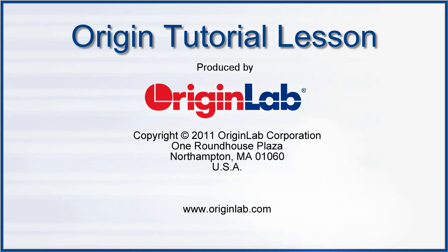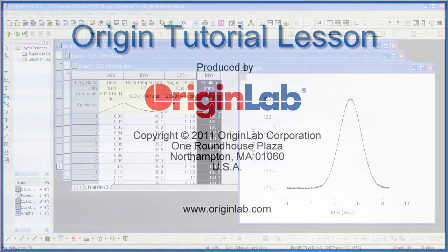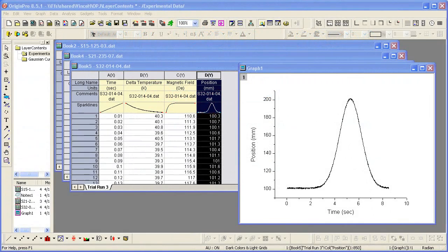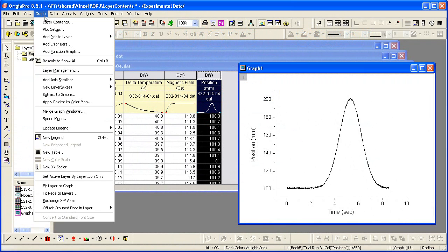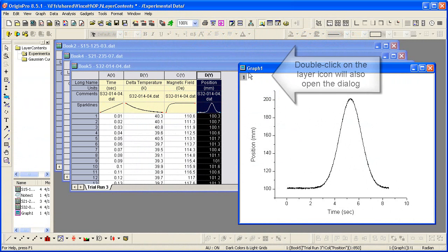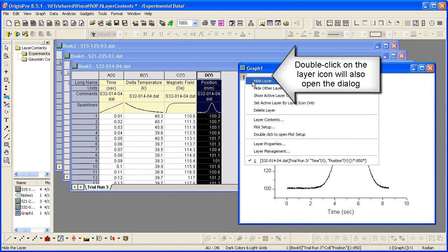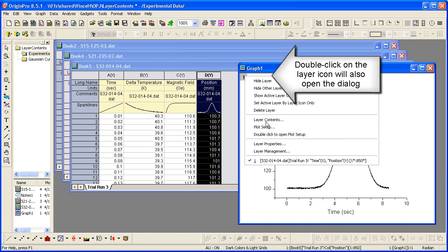In Origin version 8.5.1, the Layer Contents dialog has been modified to make it easier to add and replace data in a graph. You can access the Layer Contents dialog from the Graph menu at Graph Layer Contents, or by right-clicking on the Layer icon in the graph itself and selecting Layer Contents.